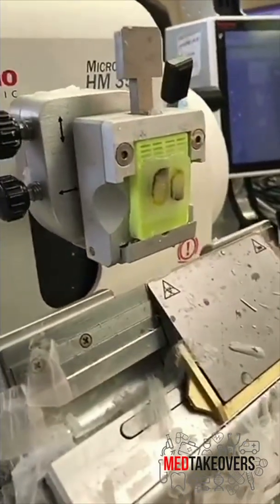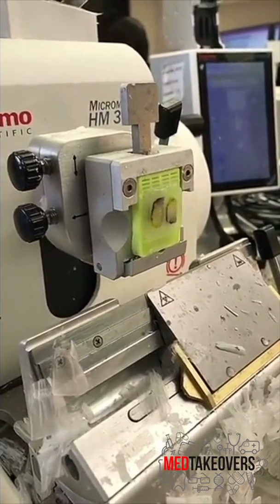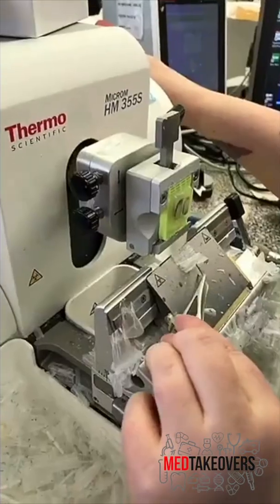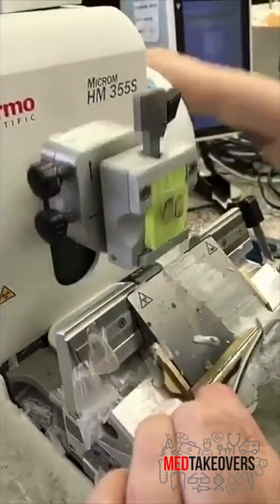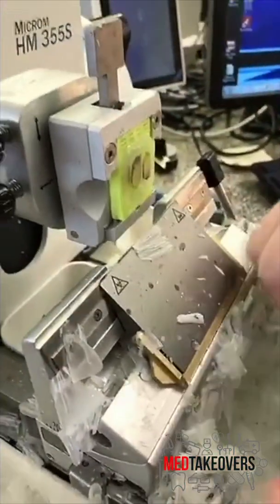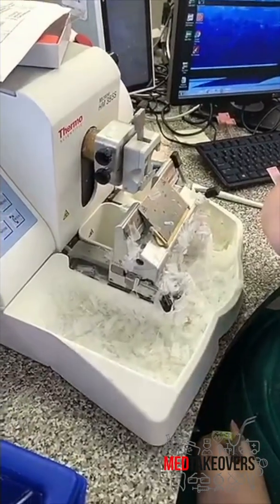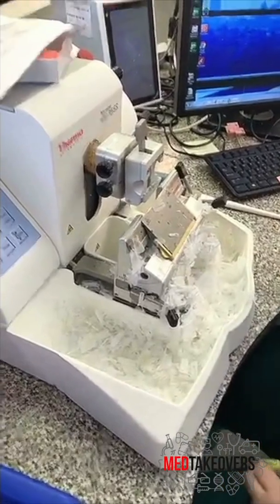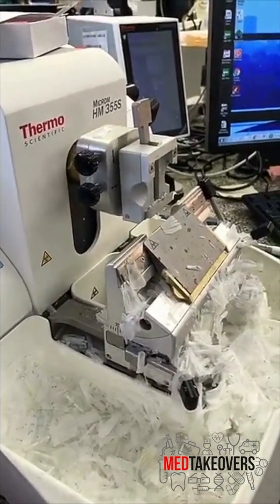After we have the tissue embedded, we put it on this machine called a microtome which lets us cut really thin little salami slices of tissue and put them onto a slide. One of our awesome histotechnologists is cutting these really thin slices of wax with skin in it using the very sharp knife on the microtome. That's an incredible job you should think about if you're interested in medical careers, because histotechs are amazing.